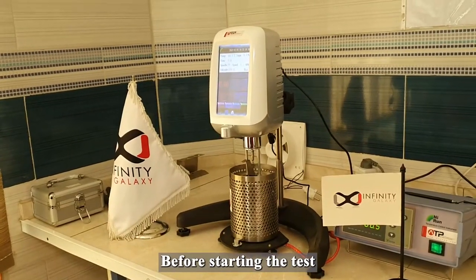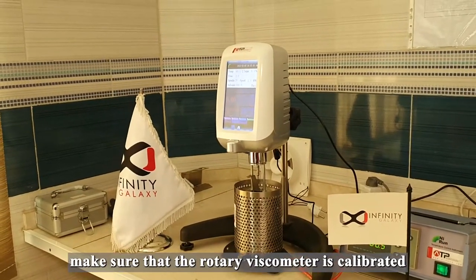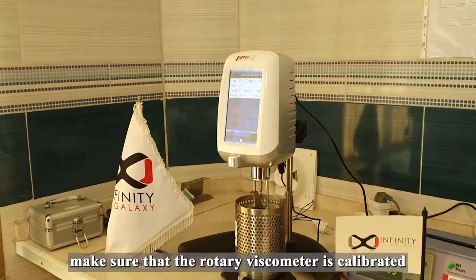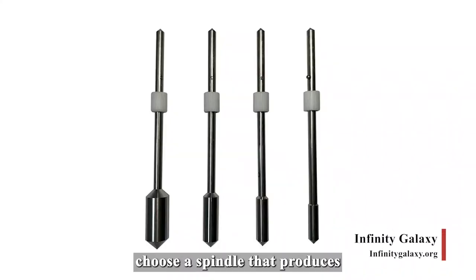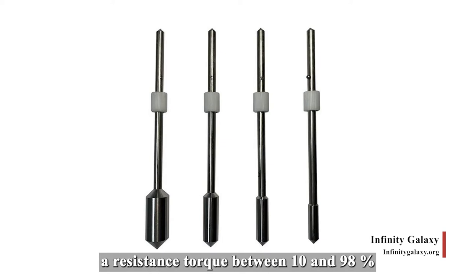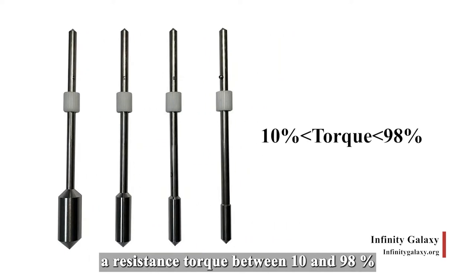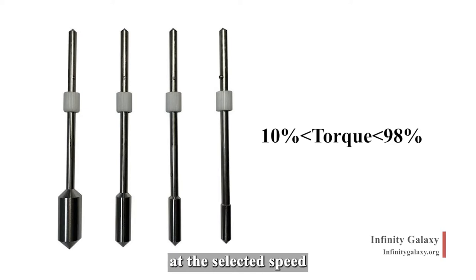Before starting the test, make sure that the rotary viscometer is calibrated. For testing, choose a spindle that produces a resistant torque between 10 and 98 percent of the instrument's capacity at the selected speed.